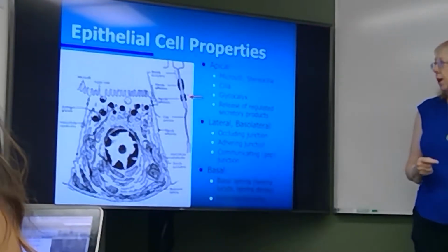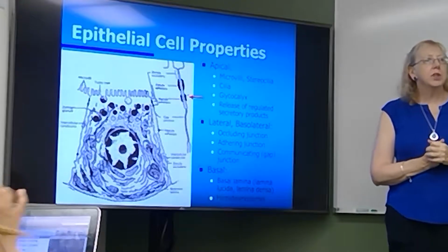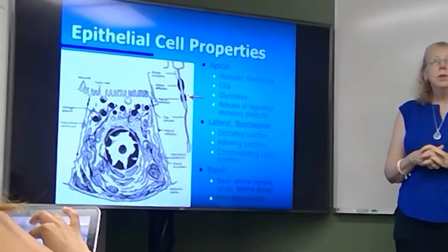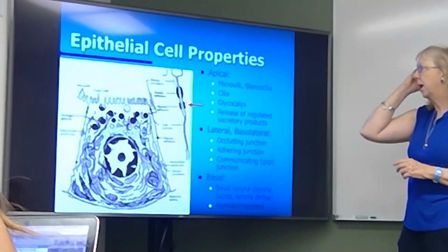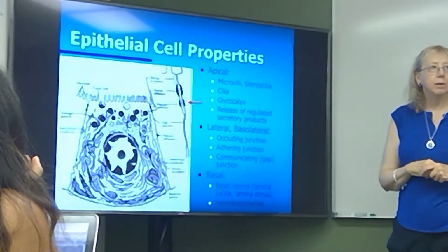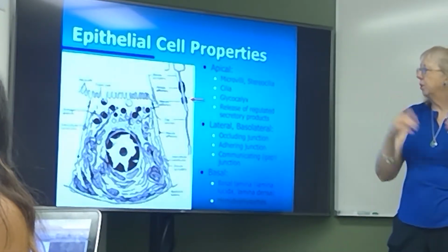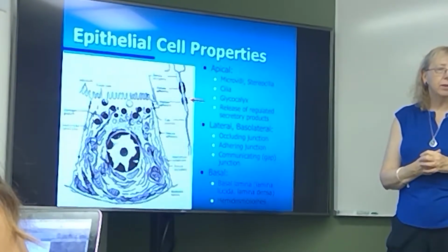Now, the cell membrane, as we've reviewed, is made up of phospholipids, and the lipids wash out during our cell processing to get water out of the cells and then to get the paraffin in the cells. But what we do see that can be stained are these proteins and carbohydrates, attached carbohydrates that are embedded within the lipid bilayer membrane. So you have this raft of other molecules in the membrane, and that is what is termed the glycocalyx. So it can be stained.